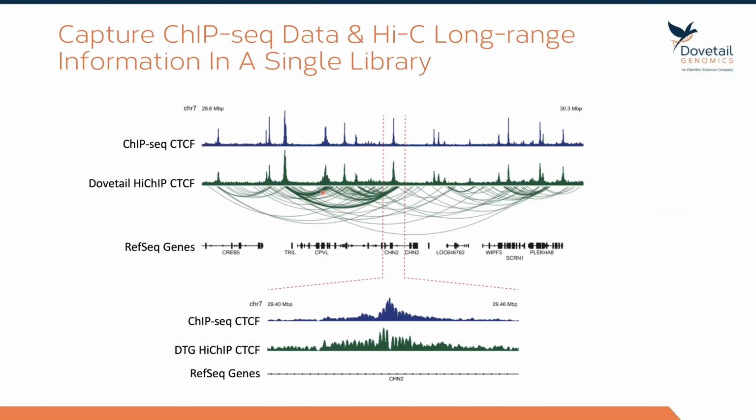And what that gives us is a view of chromatin that captures both the ChIP-seq signal and those HiC chromatin interactions. So here's just normal ChIP-seq against CTCF, and it looks like normal ChIP-seq data. We see nice peaks where CTCF is bound to the DNA. Then we're comparing that to our HiChIP, where again we can recapitulate the binding site enrichment. But now we can ask what's interacting, which CTCF sites are interacting with each other, and we can see there are strong interactions here, strong interactions here. And so we can basically say that these are forming boundaries, like CTCF-mediated boundaries or chromatin loops, right?